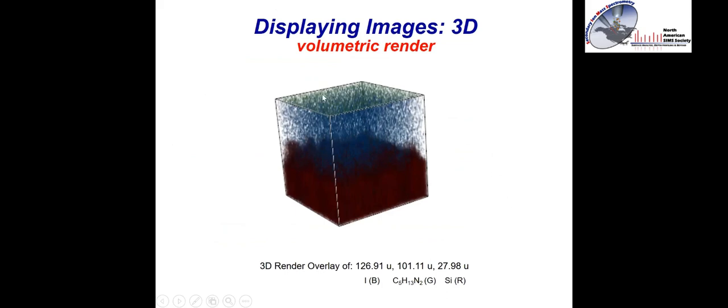This is a simple volumetric render from the ToF software of iodine, silicon on the bottom, and then this organic additive. This is from a perovskite sample. You can see the data has been forced into a cube. We can see a green layer of this organic molecule at the top, and then the iodine in the middle. So it does give us an idea of relative positions of ions.